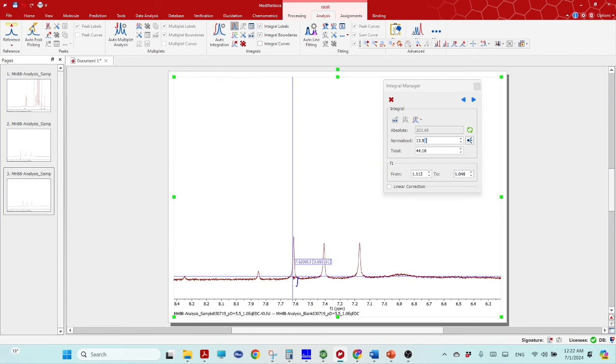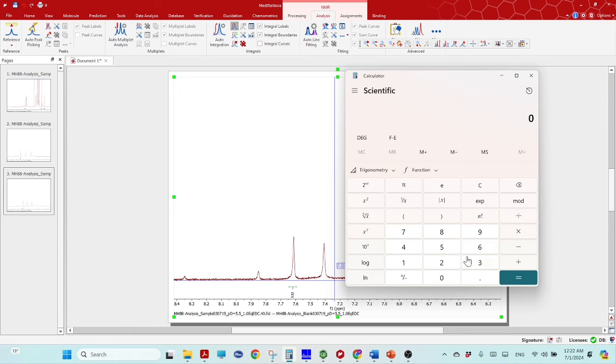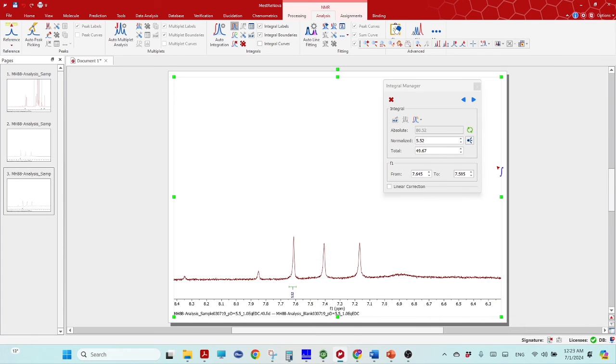So now if we integrate that part, so you can see like now it is 5.52. So if we calculate how much acid we have, 5.52 divided by 2, because this peak is for 2 protons, 2.76 times internal standard is 3 protons times 3, so you are getting 8.28. So after 10 minutes still your acid has 8.28 millimolar.